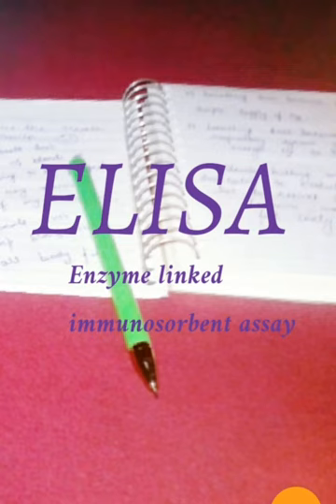So in today's video tutorial I am going to talk about ELISA. ELISA is a biochemical technique used to diagnose the presence of a particular antigen or antibody in the sample of the patient. ELISA stands for enzyme linked immunosorbent assay. That means it includes the activity of an enzyme. Immunosorbent means you need to absorb some sort of immunological antigen or antibody present in the sample of the patient.